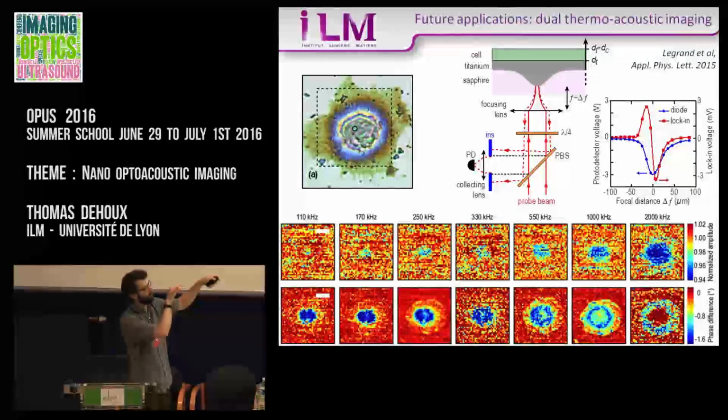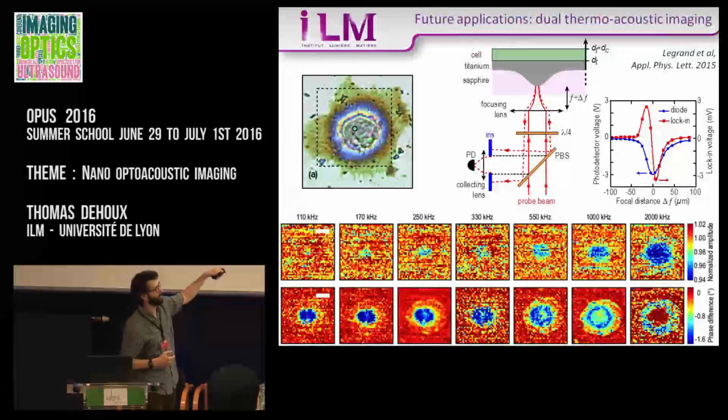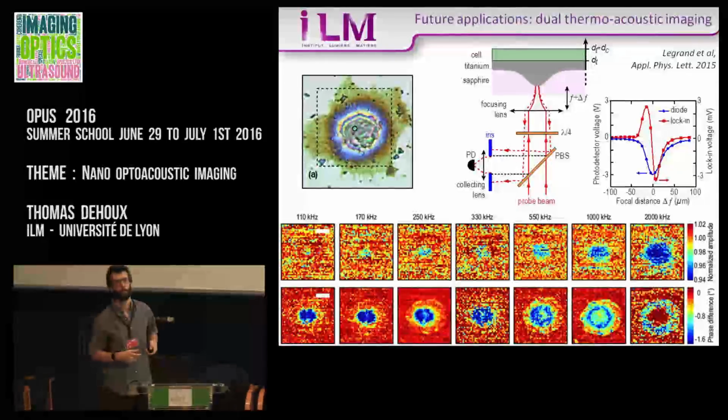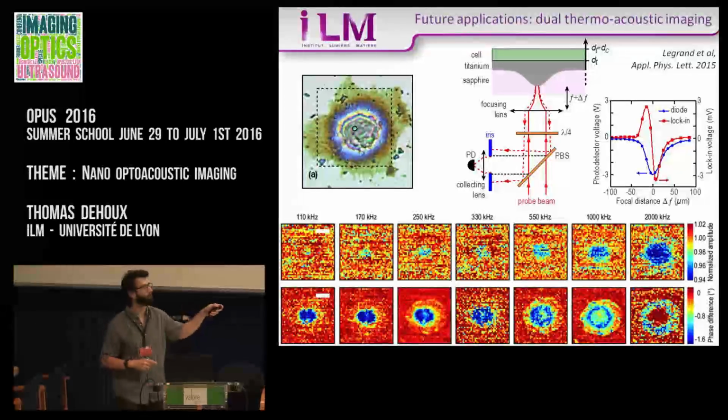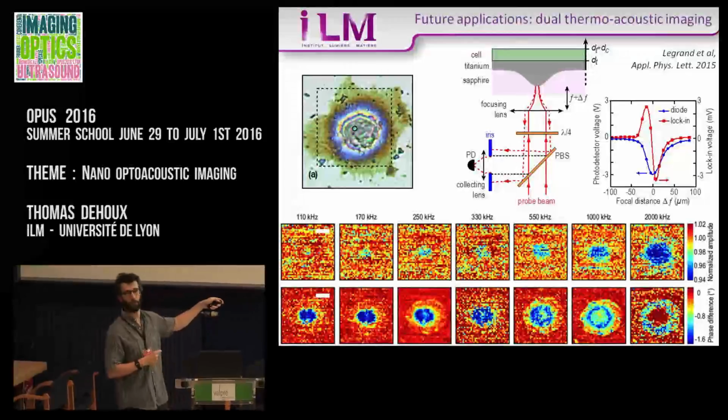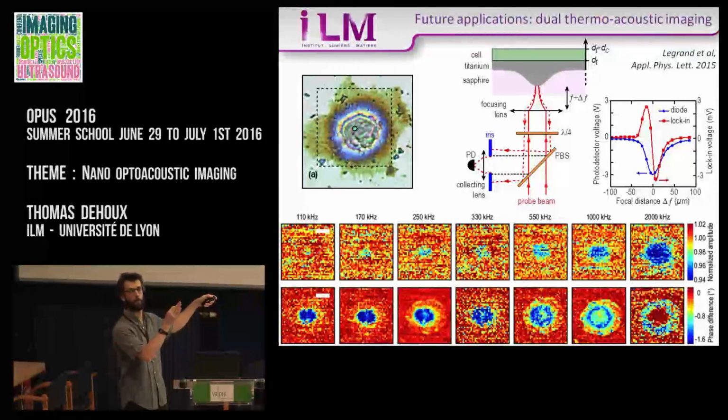And when you start to defocus the beam, the voltage on the lock-in amplifier increases, and the maximum of the lock-in voltage corresponds to where the slope is steepest. So the goal is to stay with the minimum of the lock-in. Let's say the lock-in should stay at 0, right? No, it should be at maximum. You want the highest voltage possible, to be as sensitive as possible.